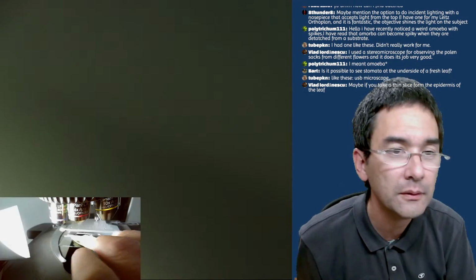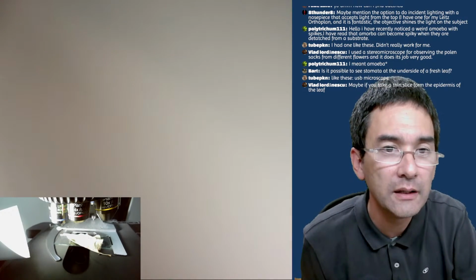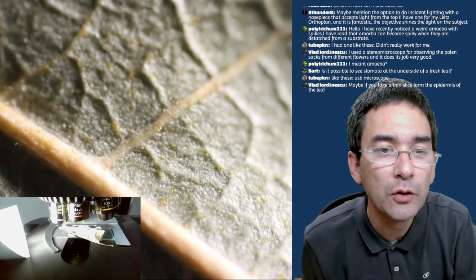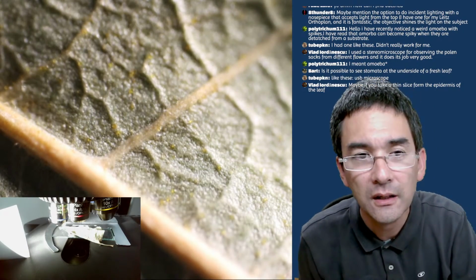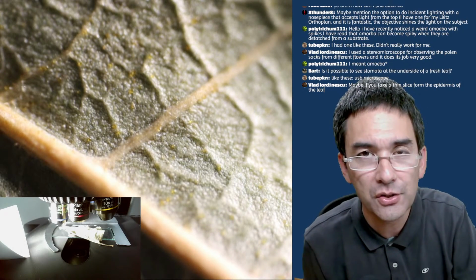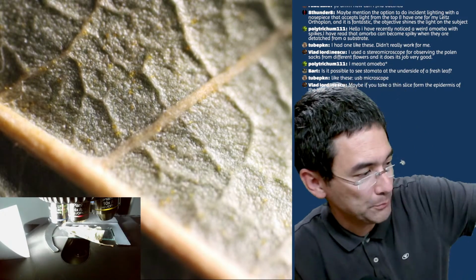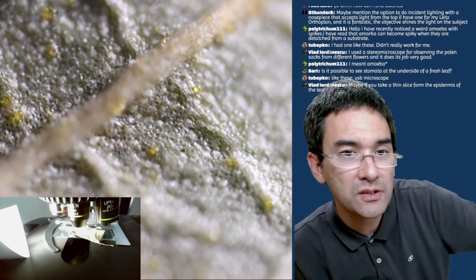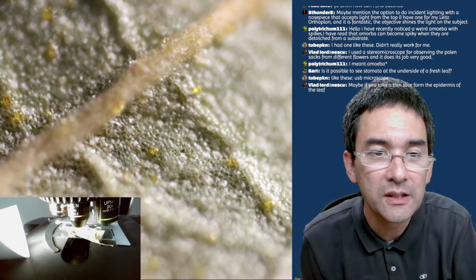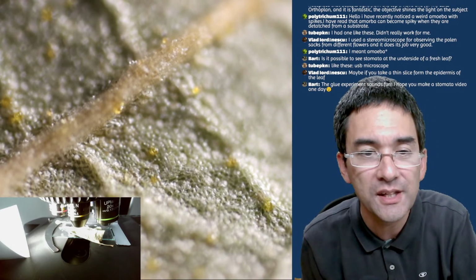Yeah, so, let's see. This is now a little bit in the shadow, and I never know into which direction I have to turn it. Here we go. I mean, what you see over here, of course, is the vascular bundles in the vascular tissue, but because the cells are so close together, it's not possible to see the cells as separate, because the cell walls are all sticking together. Maybe those little... It looks a little bit like a sponge. Okay, so they seem to be the cell walls of adjacent cells.